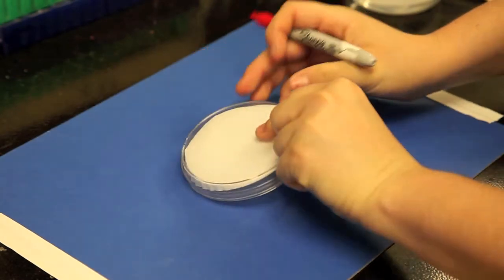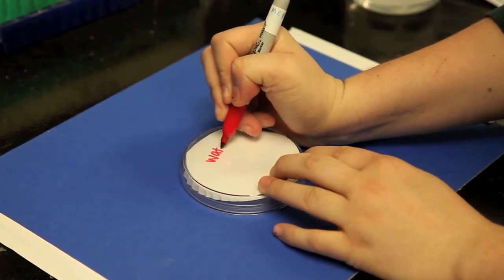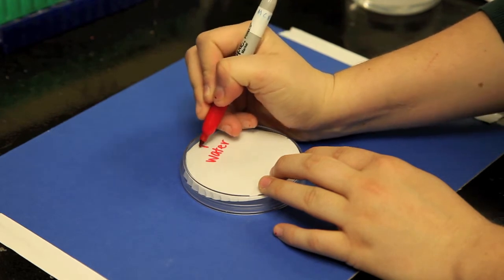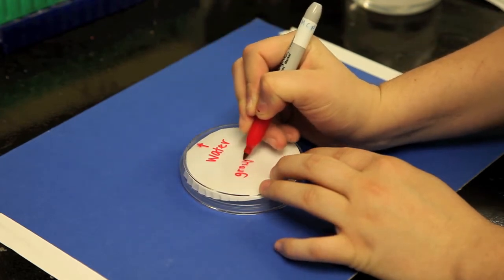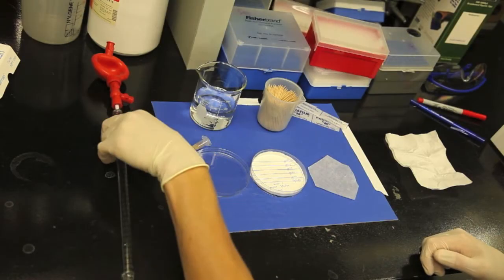Next, turn the plate around and put any additional labeling information that will help you recognize the plate, including treatment, group number, and genotype. Once you finish your labeling, you're ready to start your experiment.